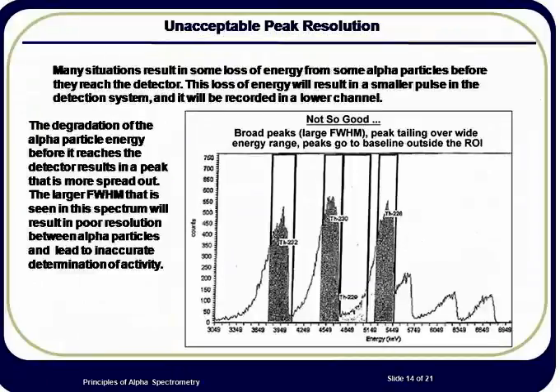The alpha particle spectrum is significantly affected by the thickness and mass of the sample test source. Seen here is a spectrum from a sample that has unacceptable peak resolution. Note that the peaks are very broad. Some have full-width half maxima of over 300 keV. Also note that there is considerable spill down of the thorium-228 peak into the thorium-229 peak area. So much spill down has occurred so that the thorium-229 peak is not even distinguishable. This sample needed to be re-prepared.